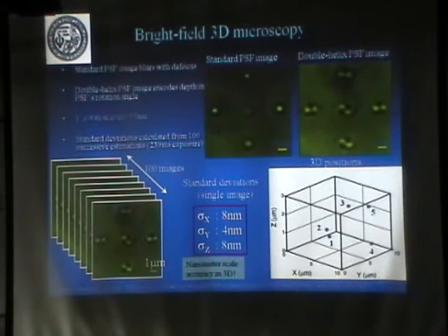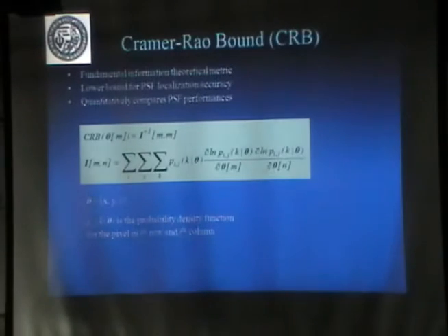If you calculate that, it gives you this variance that I gave you here. It doesn't matter how you calculate that. For this experiment, there is a minimum variance. That absolute minimum, or fundamental limit, is given by the Cramér-Rao bound: the variance that you can achieve. There is a technical condition that the estimation has to be unbiased.